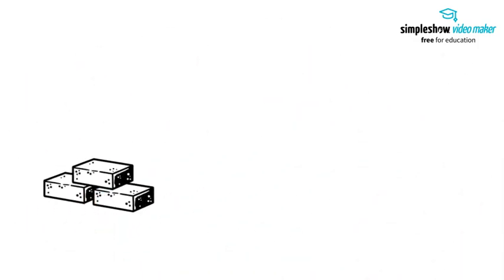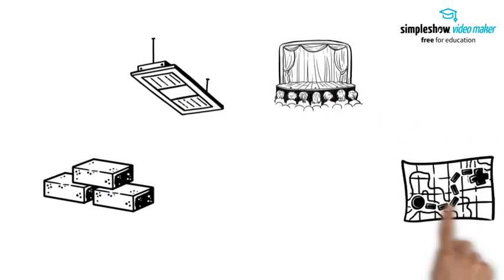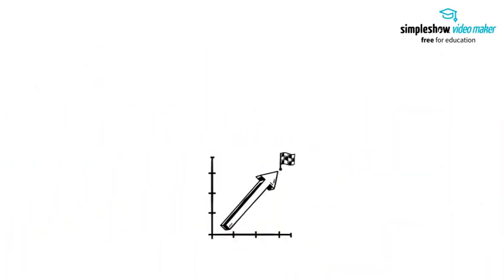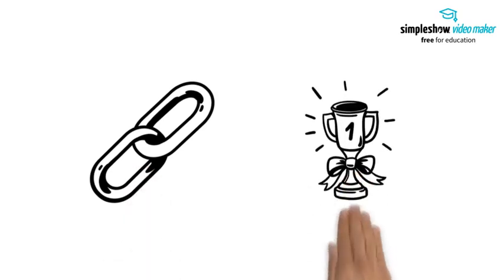The base provides stability, while the illuminator sheds light on the subject. The stage, with its clips, holds the slide in place. The objective and eyepiece lenses magnify the image, brought into focus by the coarse and fine adjustment knobs. The diaphragm controls light intensity, ensuring the best view.